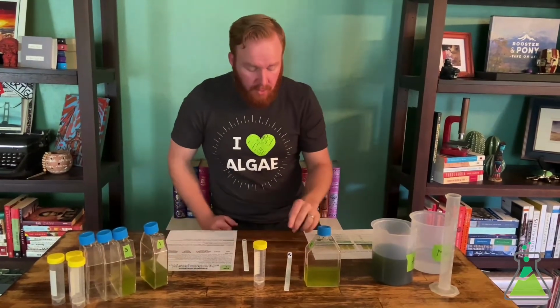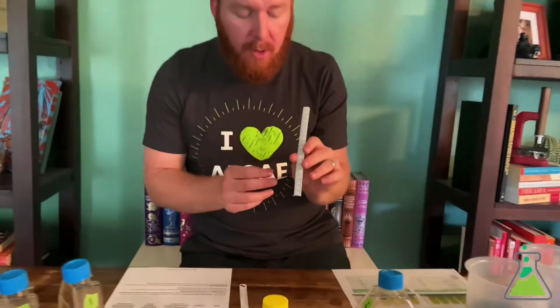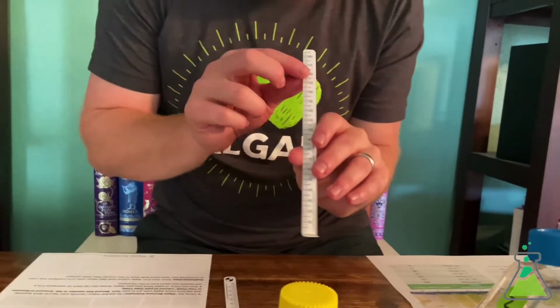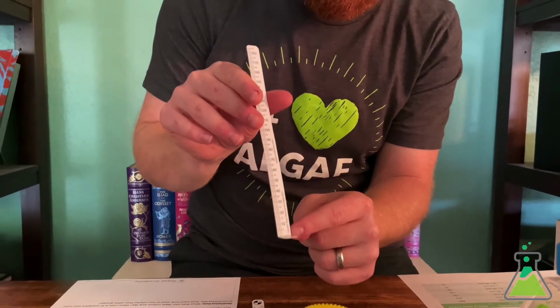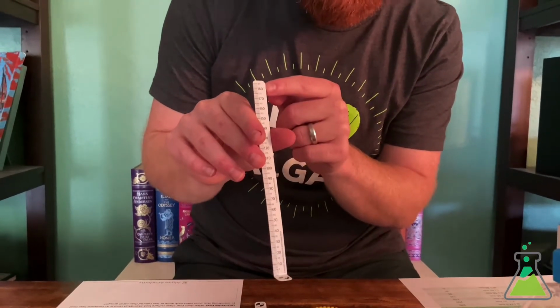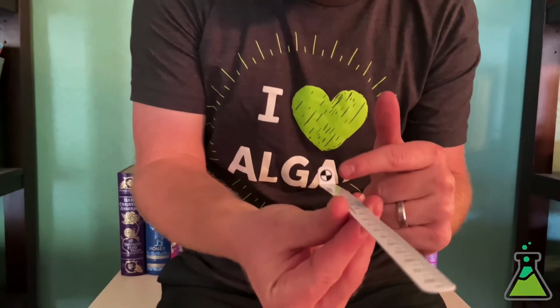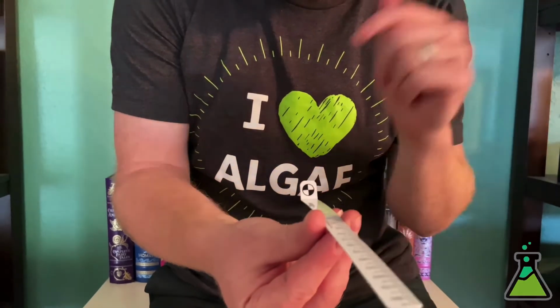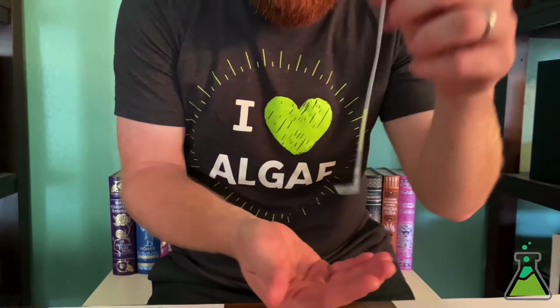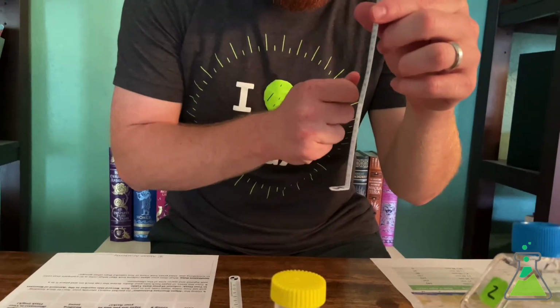All right, so the Secchi stick. The Secchi stick has 2 different pieces. The first part is the ruler. And so this really long, tall part here, it starts at 0 millimeters and goes all the way up to 185. And then the second part is this little shield here. And so it's a black and white shield. And what we're going to do is watch this little shield as we lower the Secchi stick vertically into the water. And when we no longer can see that shield, we're going to take a measurement.